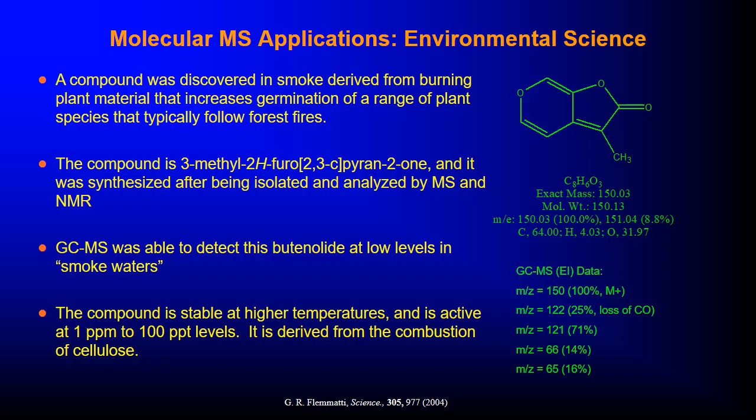The compound is 3-methyl-2H-furo[2,3-c]pyran-2-one, and it was synthesized after being isolated and analyzed by mass spectrometry and NMR.